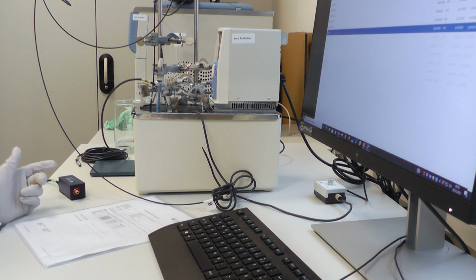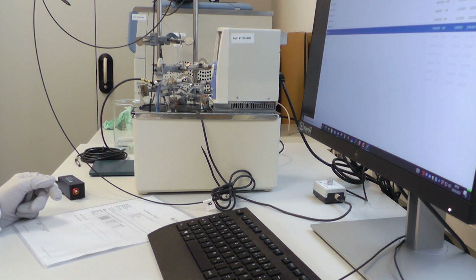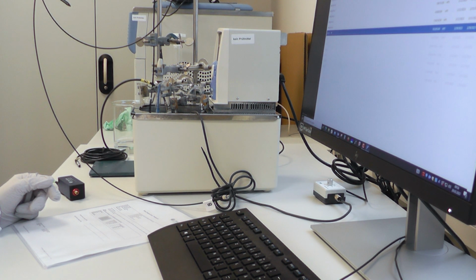For more information on how to make the buffer solutions and the calibration setup, you can watch our video on preparations for pH multipoint calibration.